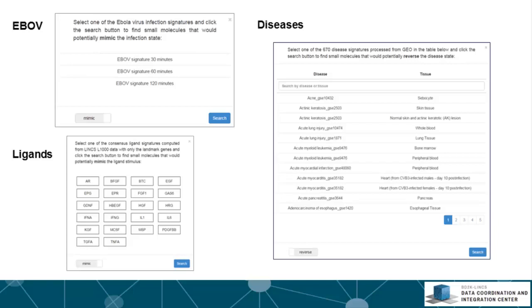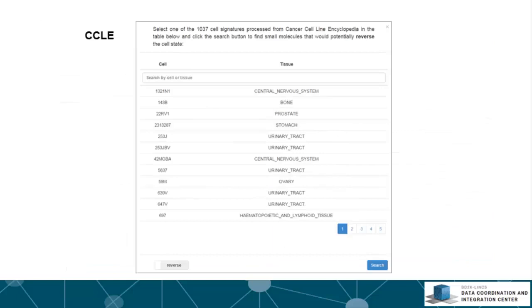The ligand signatures are consensus ligand perturbations calculated from another LINCS L1000 subset called LGP4. The CCLE signatures were computed from the CCLE gene expression data by comparing the gene expression profile of each cell line to the rest using the characteristic direction method. The goal here is to find small molecules that can potentially inhibit the growth of those cell lines in a specific manner.